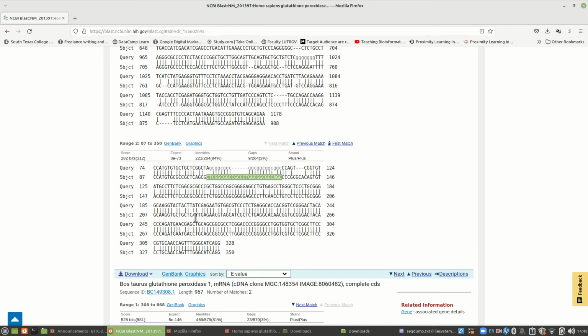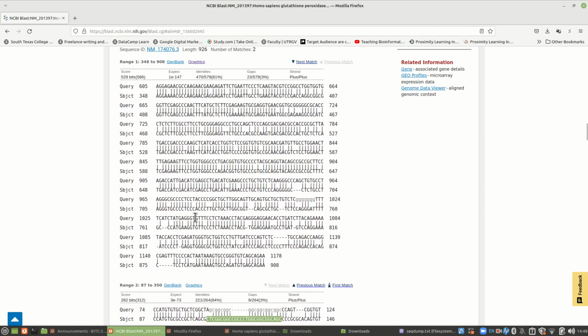I don't expect you to go into detail. You just need to pick out the main features, the main features that are different between these two. Here's an AG that's missing. Not a big deal. It is a big deal, but here you have maybe an insertion or deletion. There are different places along here, but these larger pieces are probably the more interesting ones. All right, here's an interesting one where you have two on either side. Notice it's a TG and a TG.